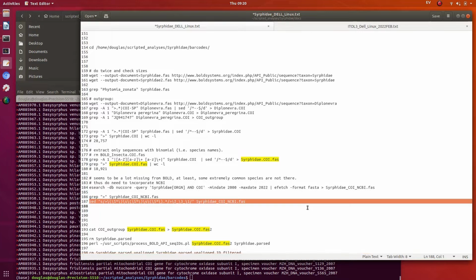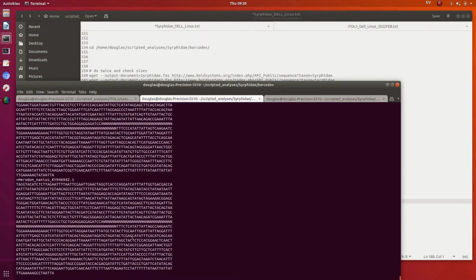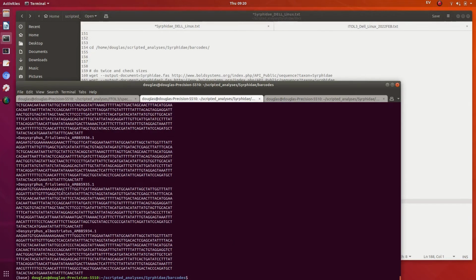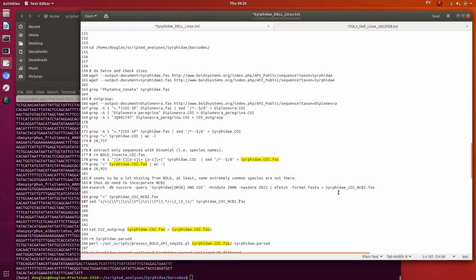So let's copy this in. Yep, this looks nice. So we're going from this very verbose output to a nicely arranged, standardized format. So this is a new command which we put into our set of commands as we build our pipeline.